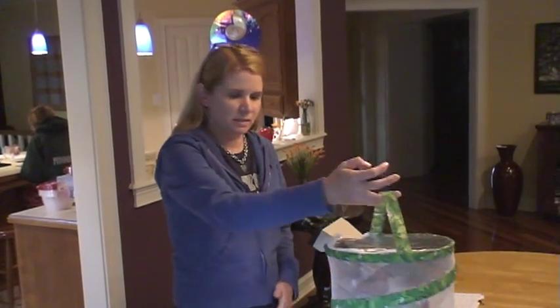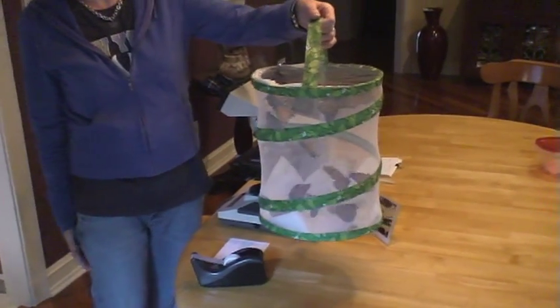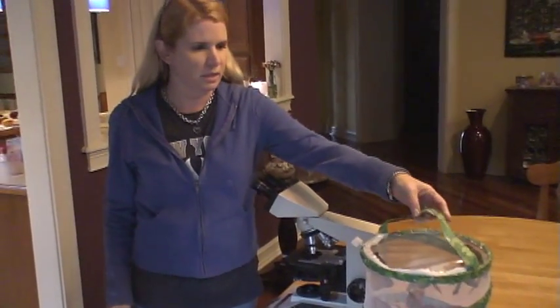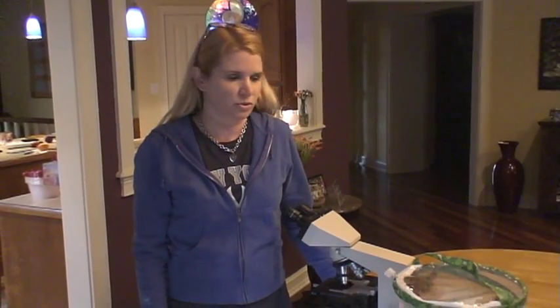These are monarch butterflies that I have raised from eggs that I found on the milkweed in my backyard. I'm going to show you how to test them for the parasite OE, which stands for Ophiocystis electroscura.